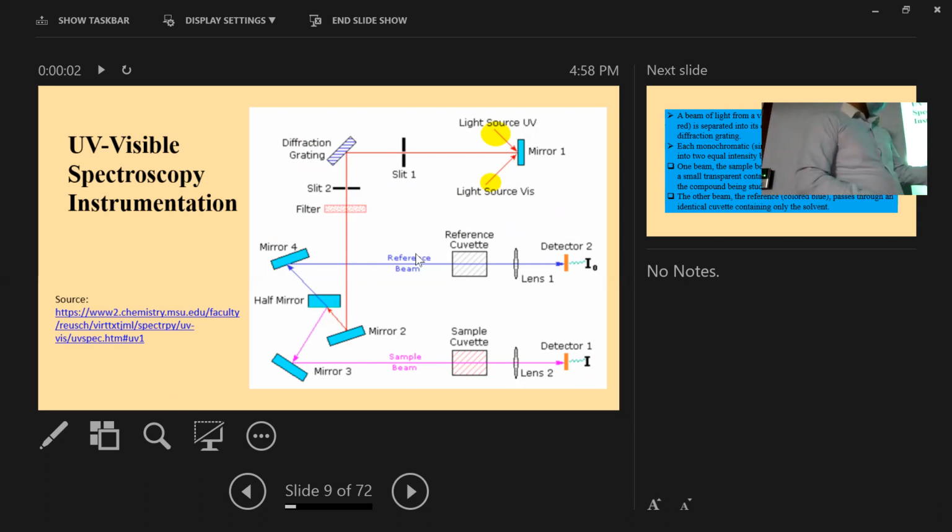If we have different amounts of solvent or substance, let us consider we have 1 milliliter of the sample, and another cell with a different cell length.